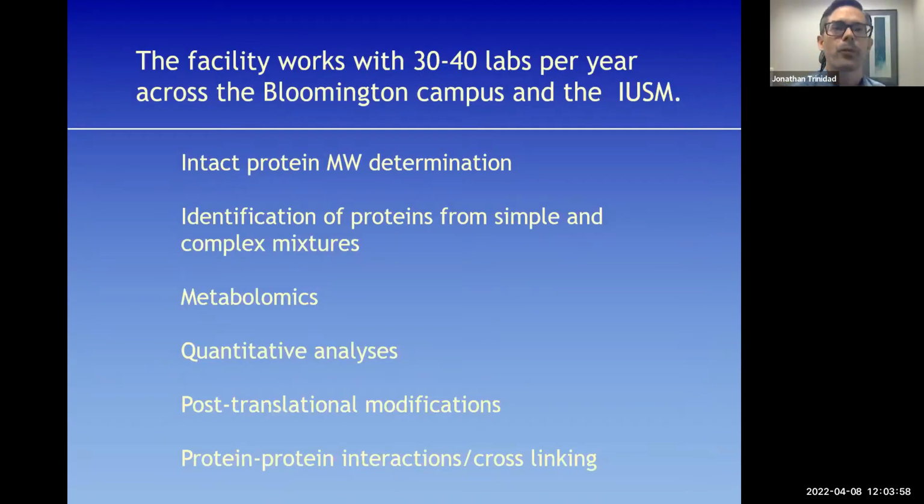So today, what I wanted to do was give you a flavor for the types of things we do here, and in a more practical sense, some experimental parameters if you're a more biologist type, about how you might interface with mass spectrometry. And then I wanted to talk a little bit about my particular interest, which is protein glycosylation. If I'm jumping around too much from topic to topic, I apologize, but I just want to really highlight some of the recent published work that we've done with various collaborators.